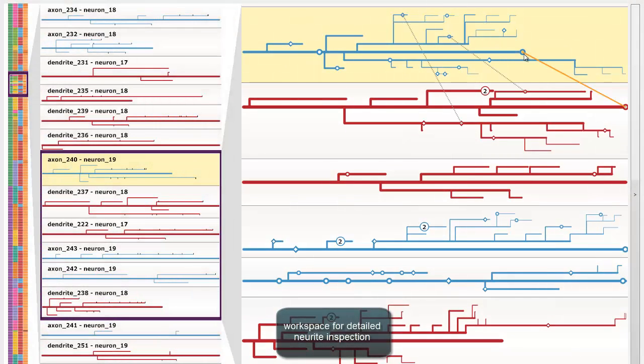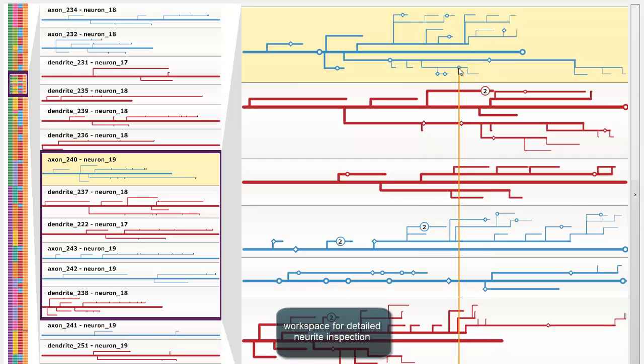Synapses of a neurite are displayed as small nodes. When hovering over a synapse, a visual link to the connected neurite appears.